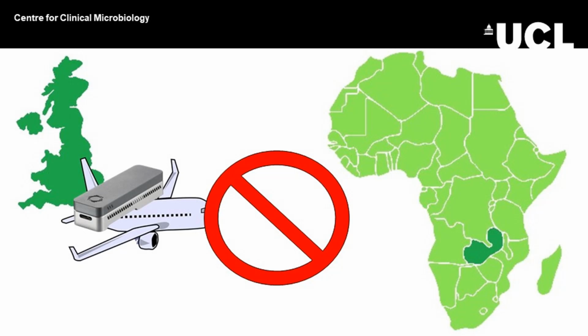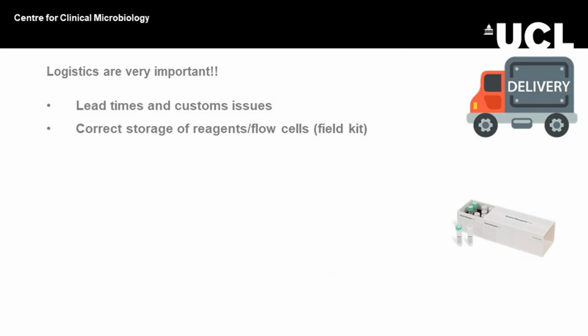So that's the actual practical laboratory side of things. This bit is the things that I think maybe people don't necessarily think are going to be that important, but actually it turns out it really is. So product lead times and customs issues.